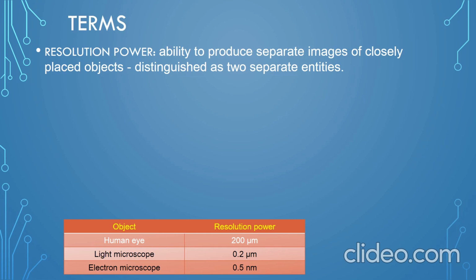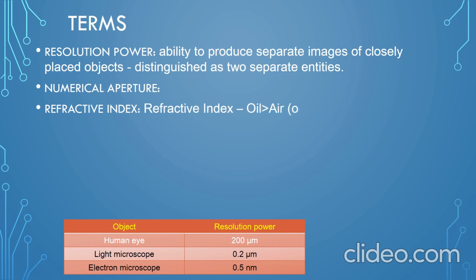What is meant by magnification power? Magnification is a process of enlarging the image of the specimen, and it can be calculated by multiplying the objective lens magnification power and the ocular lens magnification power. For example, the ocular lens magnification power is 10x, and the objective lenses are: 4x objective lens is 4 times, 10x is 10 times, 40x is 40 times, and oil immersion is 100 times.